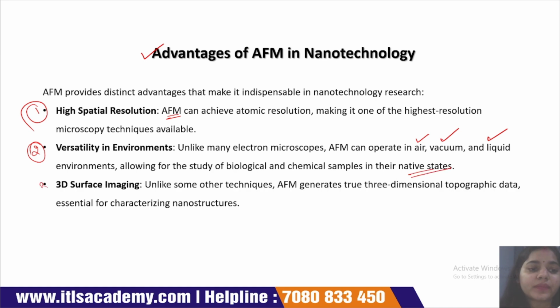Third, 3D surface imaging. AFM generates true three-dimensional topographical data, and this data is essential for the characterization of nanoparticles or nanostructures.